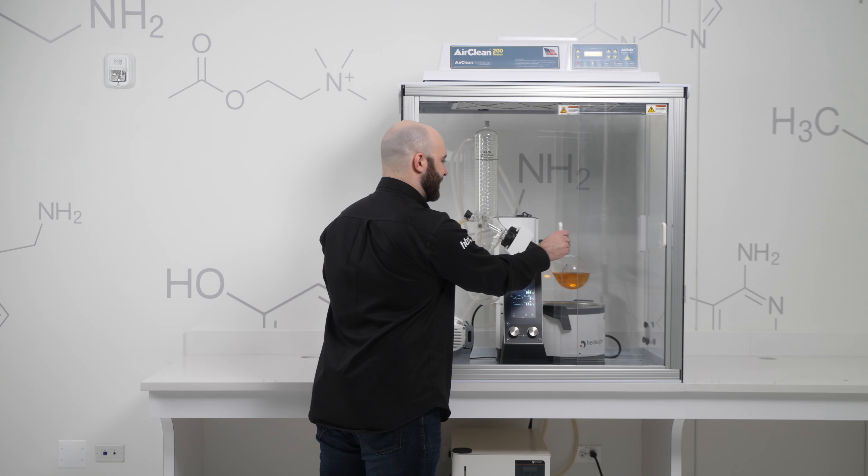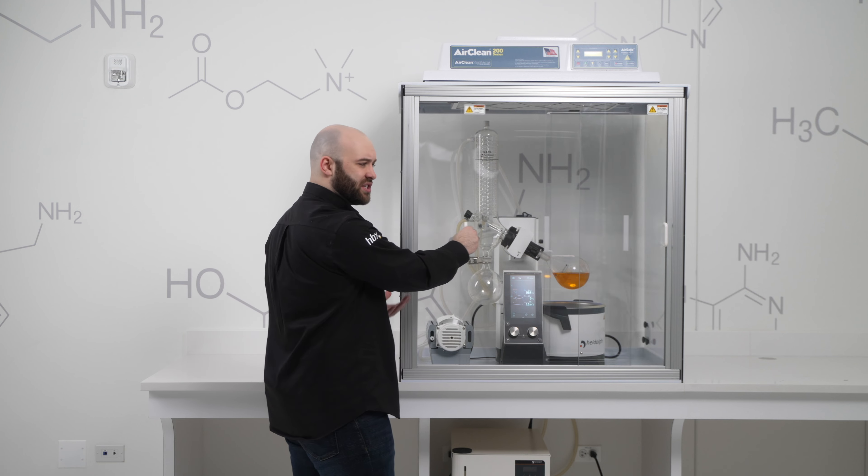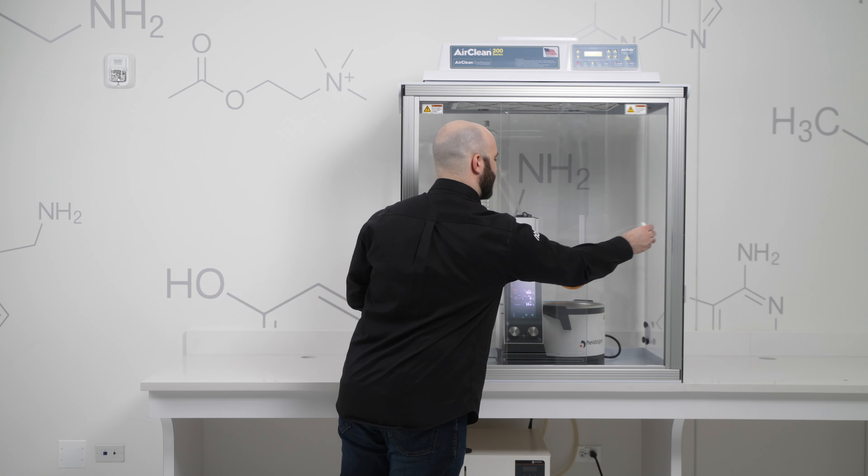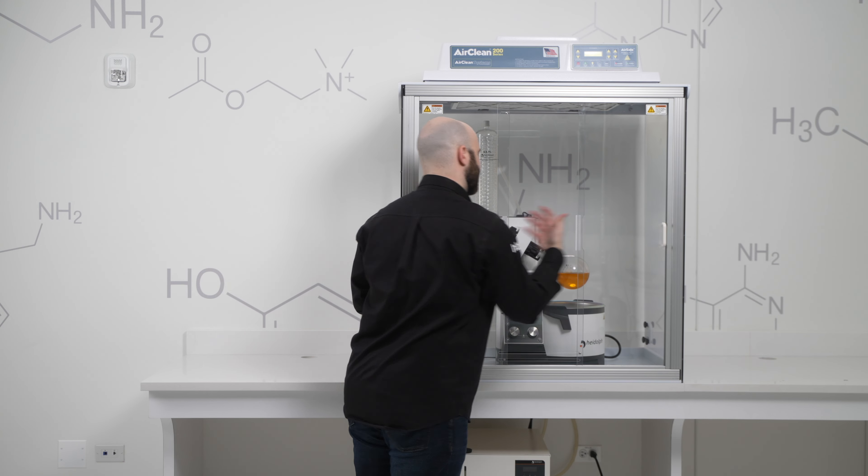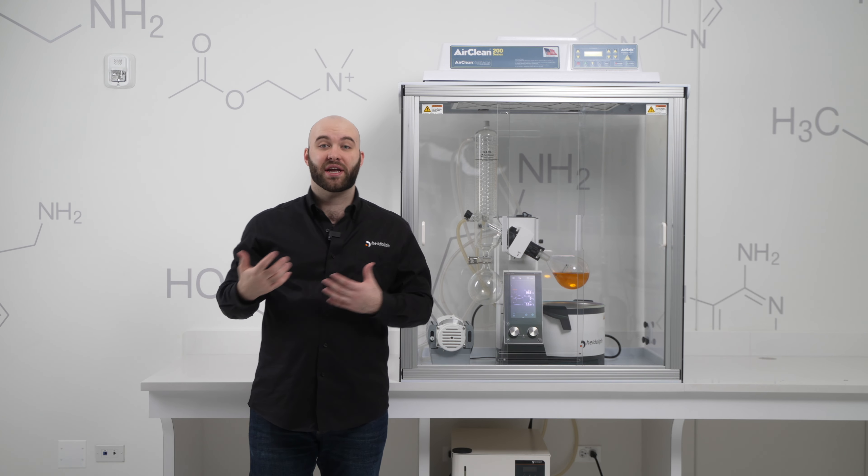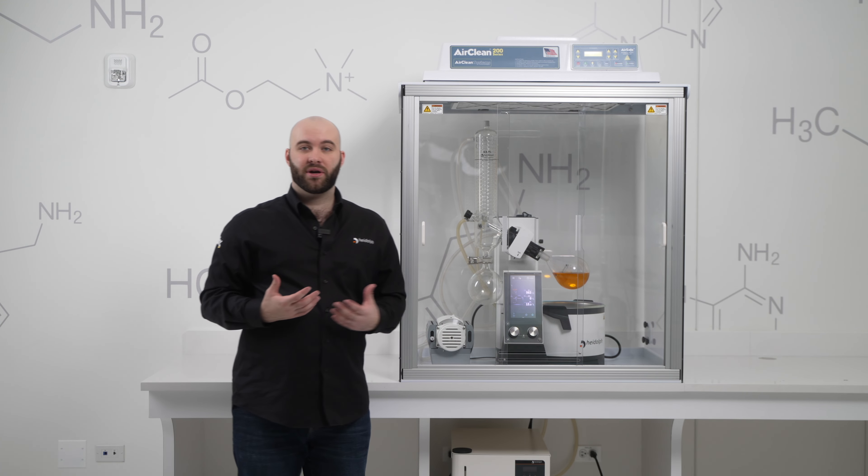The air clean enclosure makes for very easy operation thanks to the three sliding doors. This allows us very easy in and out with our evaporation flask, our receiving flask, our heating bath in case we want to refill it, while also enabling very easy access to our panel for changing any parameters.